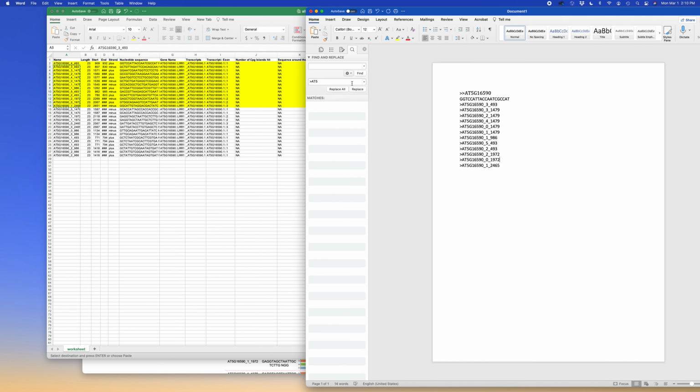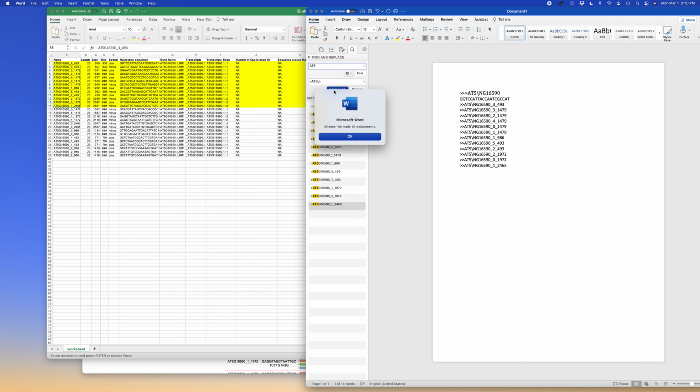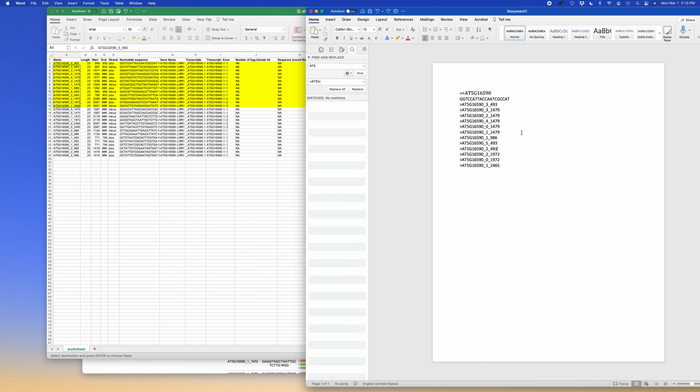Okay, there we go. Oh, and one other thing. Let's see, can we do this? Nope. Oh, that's not what I want to do anyway. Forget that. But at least we've done that, so we can put a return in.